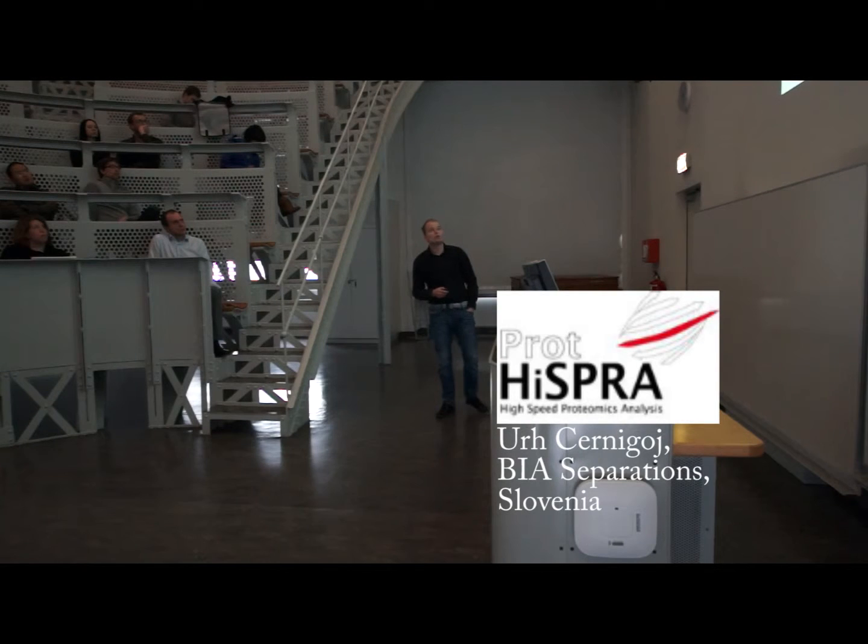Approaches which we tried at the beginning. Firstly, we wanted to co-polymerize the nanoparticles of titanium dioxide into the monolithic matrix, because the monolith is produced from the monomers. So you polymerize it and you get the final structure of the monolith. So if you add the nanoparticles of titanium dioxide inside, they should be incorporated in the matrix itself.